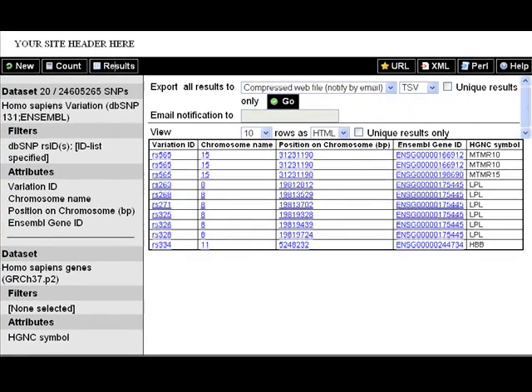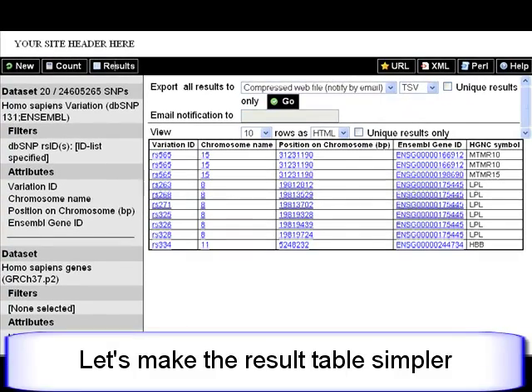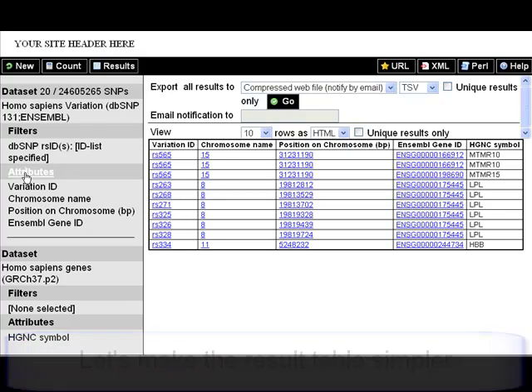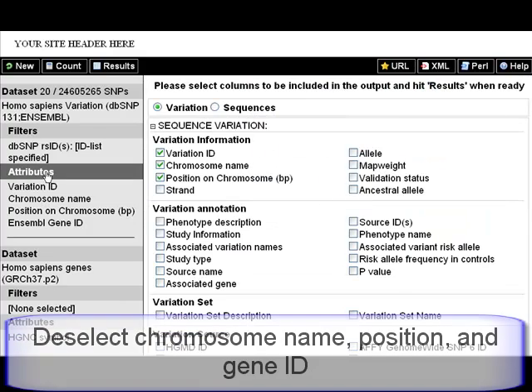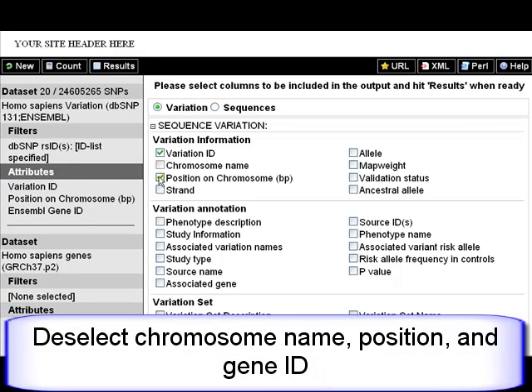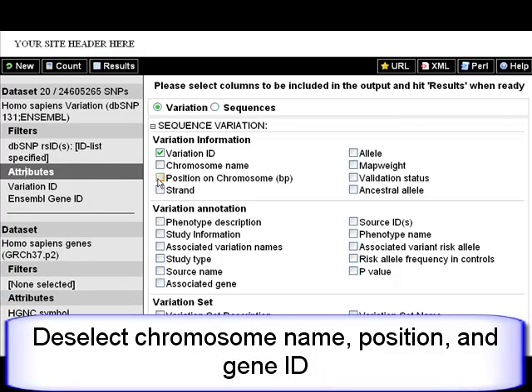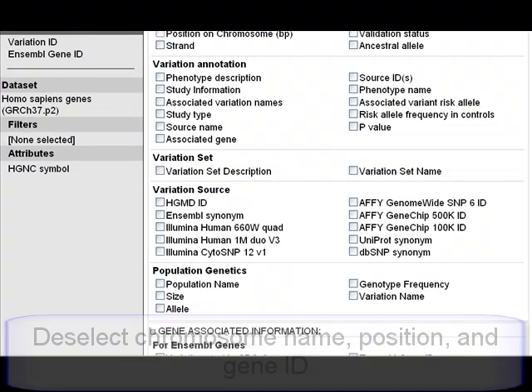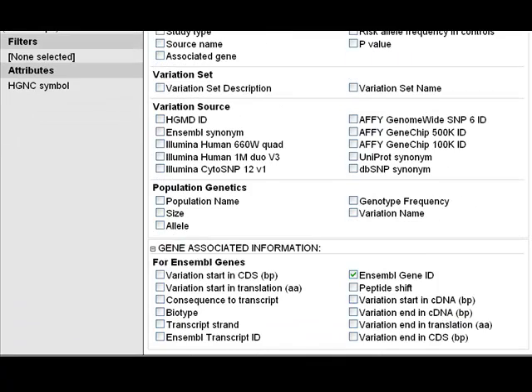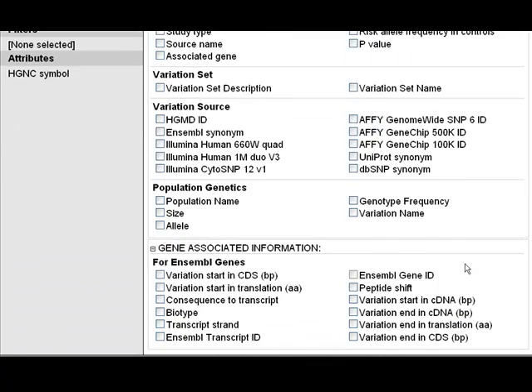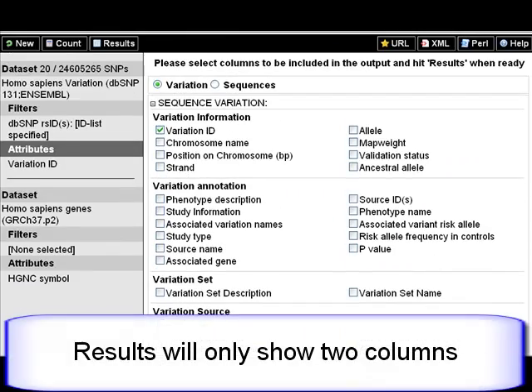Let's clean up the result table. I'm going to deselect chromosome name, position of the variation on the chromosome, and Ensembl gene ID. Now when I click Results, I will see a table of RS IDs and the gene symbol alone.